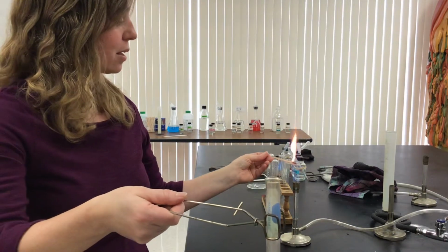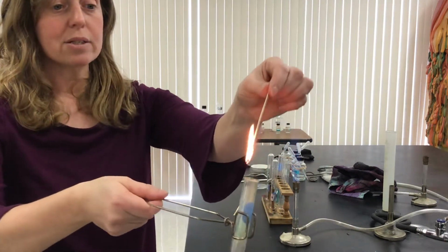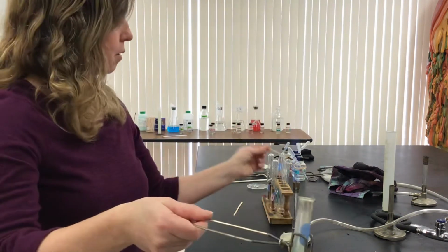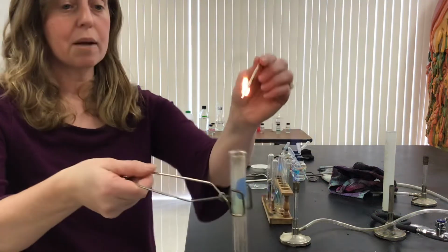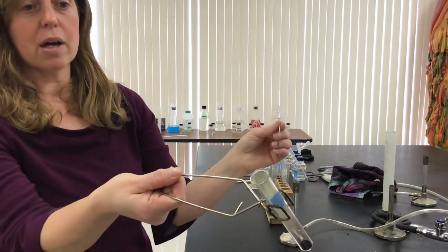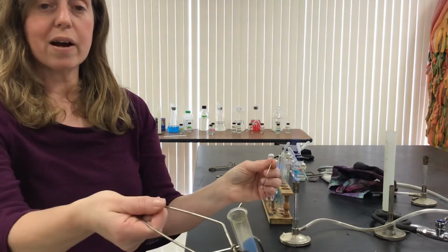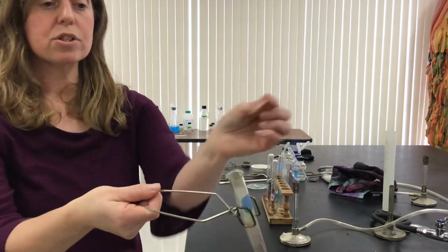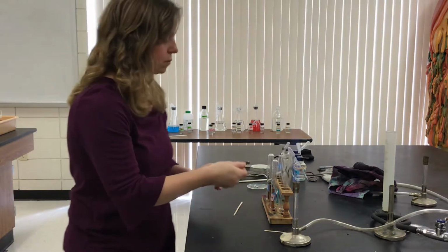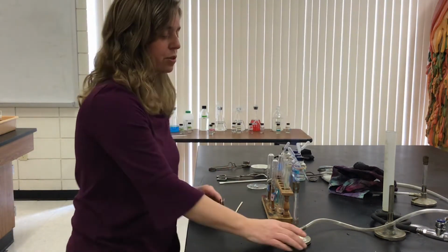So I can relight this and do it again, right? Stick it in there, you get the fog, you see that little bit of green flame, okay? I'll do it one more time, and you can see it makes a fog that comes out. So there you go, now we created a fire extinguisher. That's how we can tell, because it's going to smother the flame and put the flame out, okay? So that's an example of a decomposition reaction.